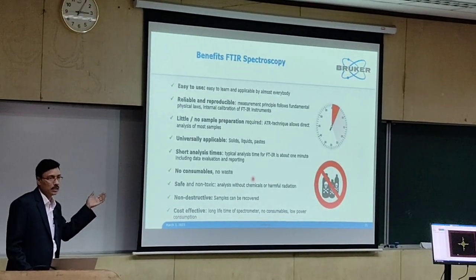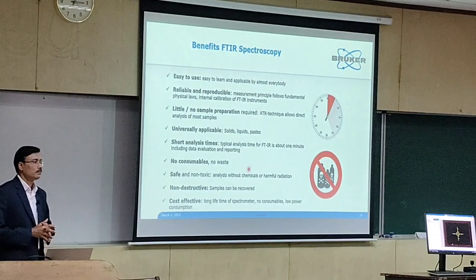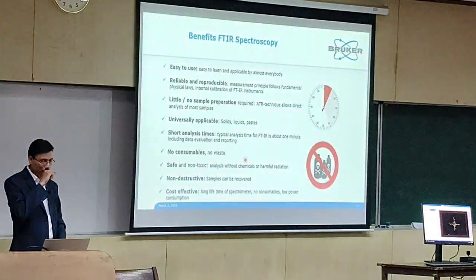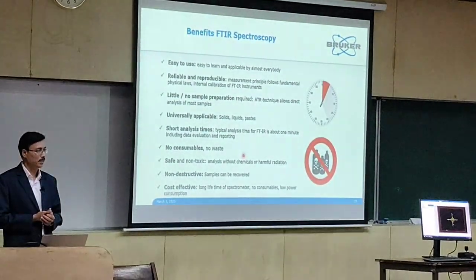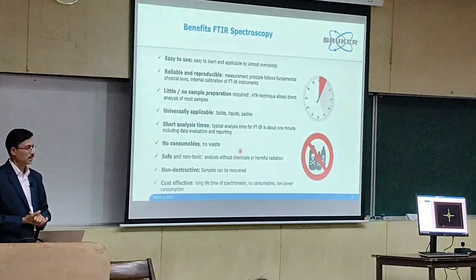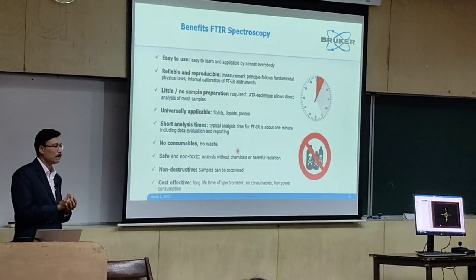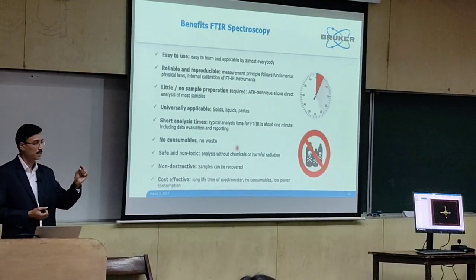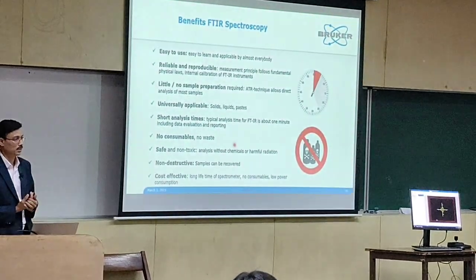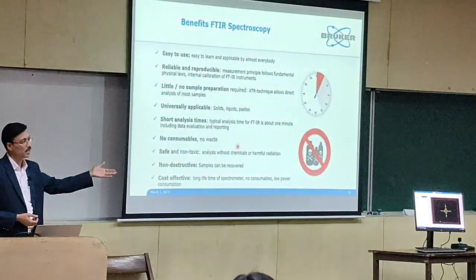Maybe if there is any doubt, you can ask. So we can do quantification as well. Actually, sir, with microscopy, for very small concentration or sample, we just focus and do the measurement. So mainly, this will be for qualitative analysis. For quantitative analysis, a representative sample is needed to get the spectra. Here we are focusing on a very small particle of 5 micron, 10 micron, so quantitative analysis is not the purpose here. If you want to do quantitative analysis, then you can do it in the macro unit. Not a problem.